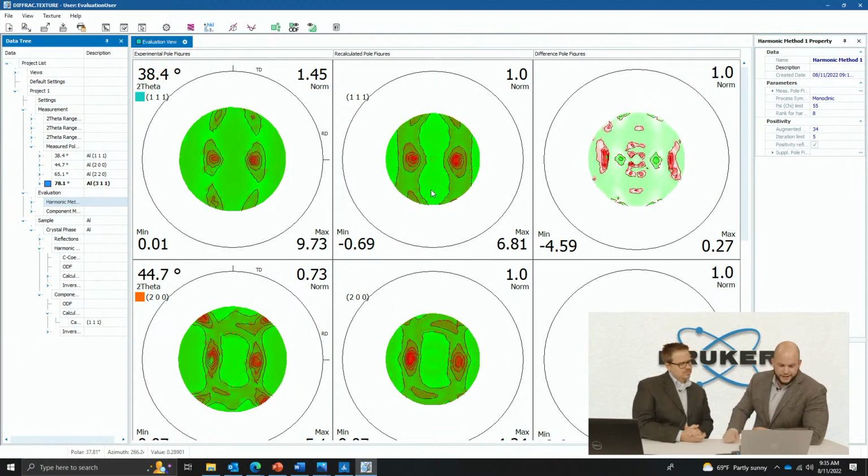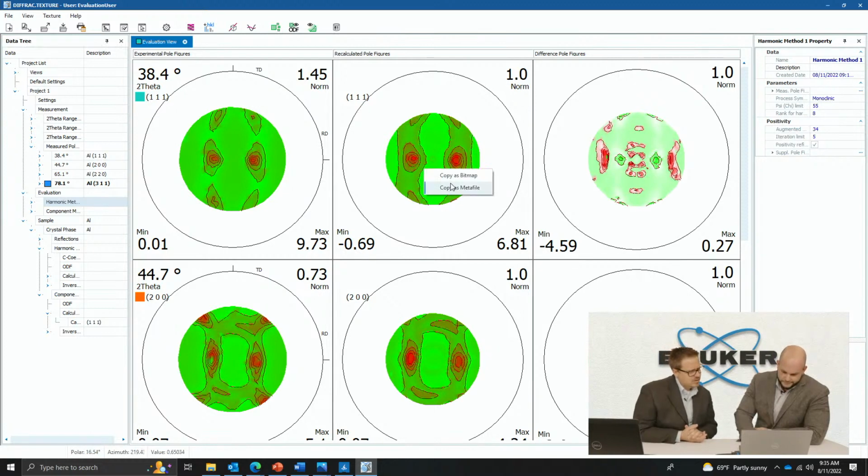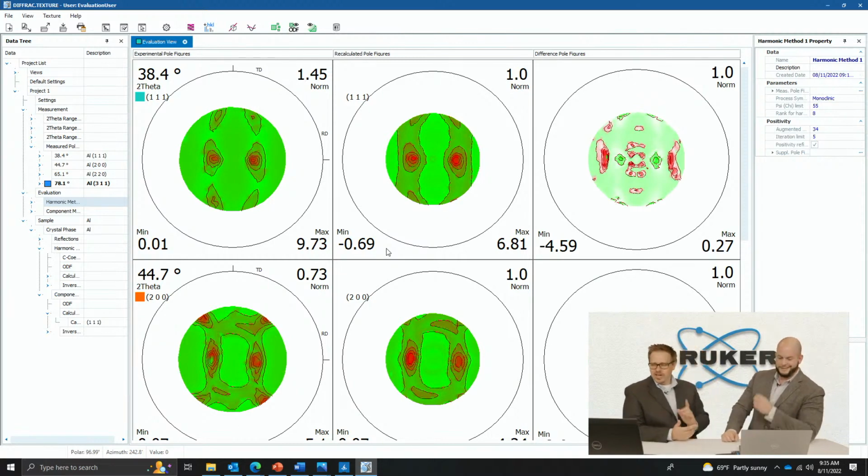I am not 100% sure about that one. It could be masking. I wonder if you right-click on it, we might be able to check what the projections are. Or no, it's not there. It's a very good question. It does look a little bit smaller. I don't know if there's any significance to that or not, but we'll look into that a little bit.